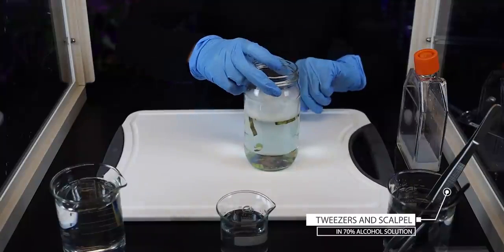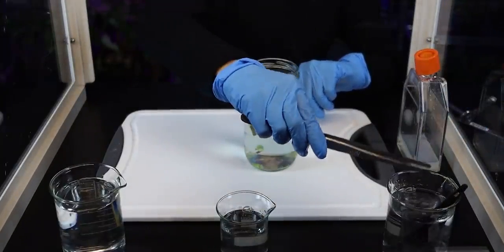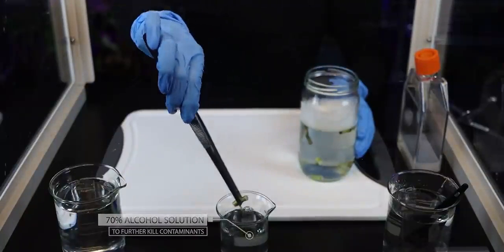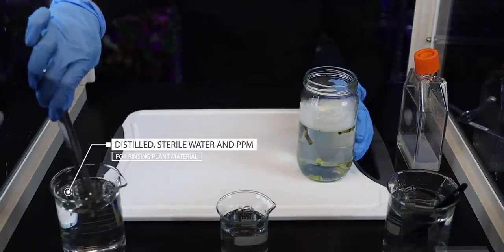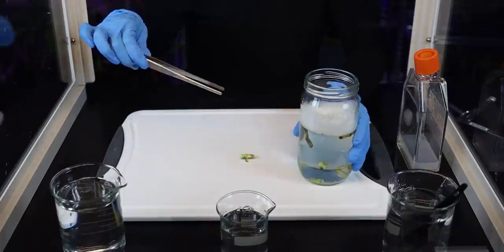I'm taking this node in my tweezers and I'm dipping it into 70% alcohol solution. This is basically a final attempt to kill off any remaining contaminants that the cleaning solution just didn't quite get. I'm now rinsing the node in sterile water and a little bit of plant preservative mixture just to wash off any of the alcohol, any of the bleach, anything that is left over on this node.